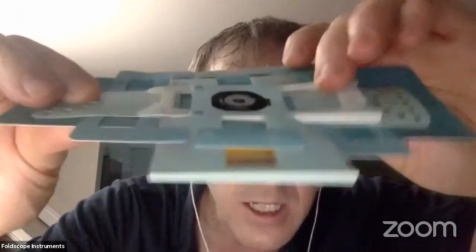The way that it works, you can do panning in two dimensions. It has a mechanical design that separates out the X panning from the Y panning, so if you're just trying to move in one dimension, that makes it a little bit easier. And then this slider in the middle is essentially your Z translation, or your focusing. You might be able to see on one side it's thicker and the other side it's thinner. So as I slide from one side to the other, I'm moving the lens up and down relative to the sample. If I'm using the device, I'm just holding it like this, pointing it at a light source, and panning and focusing using my fingers.